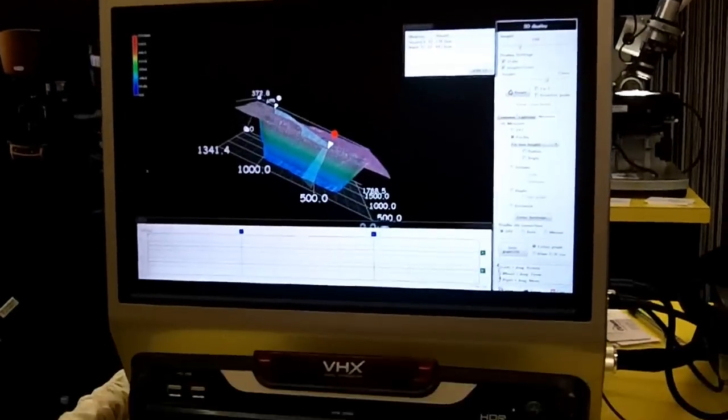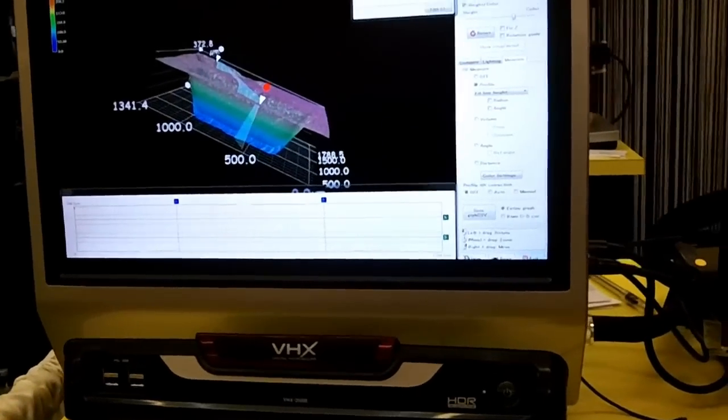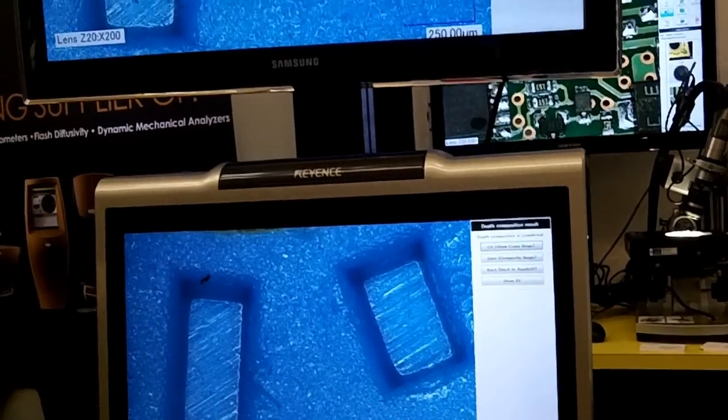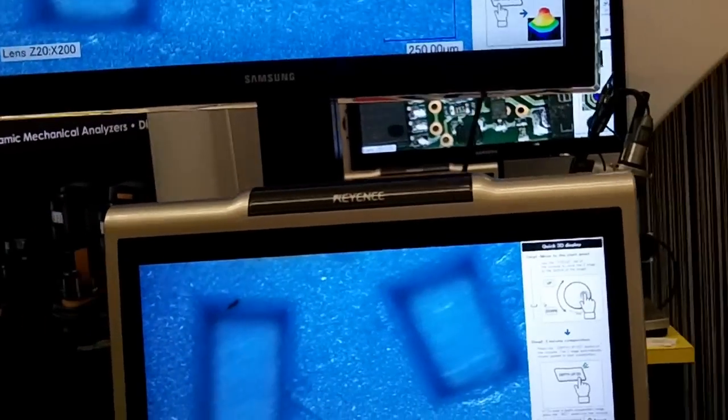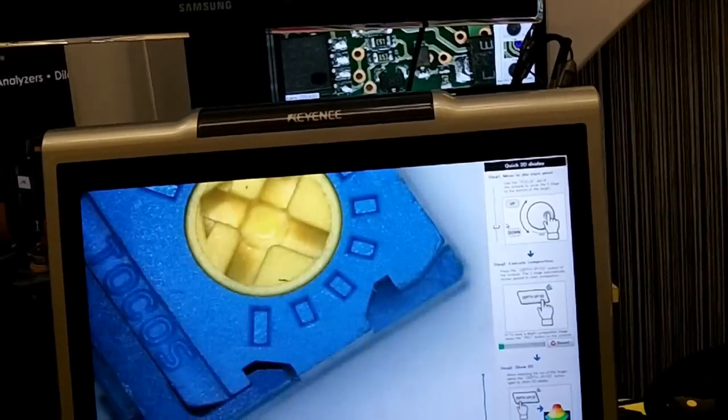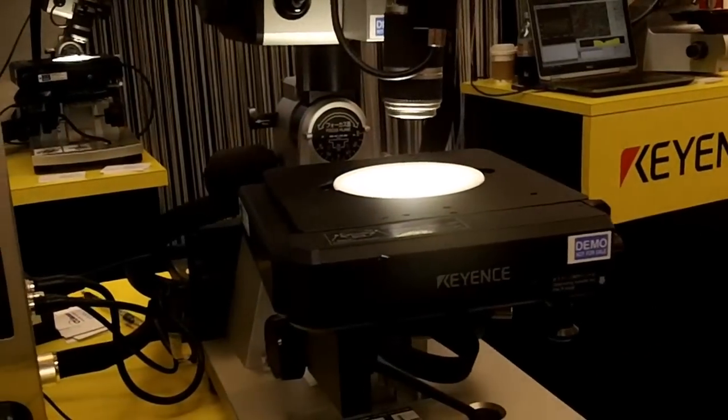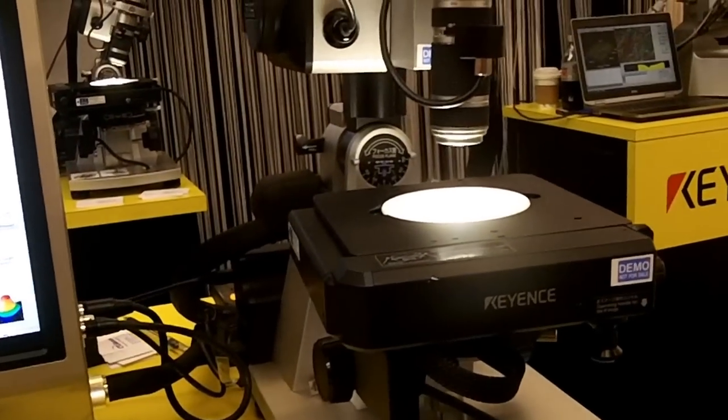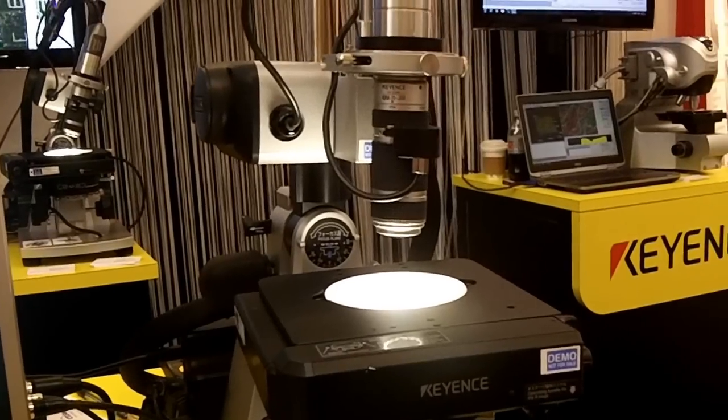So the system that we're looking at here is our VHX 2000 digital microscope. I'll show you some of the capabilities. It functions just like a conventional microscope would, but this is a digital style system so there are no eyepieces with this microscope. Everything we look at is going to be directly on screen.